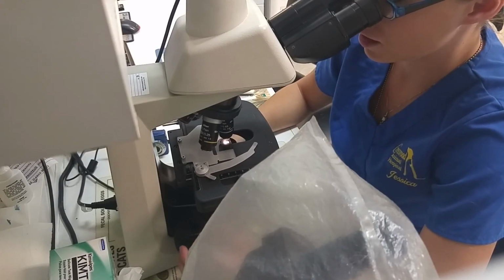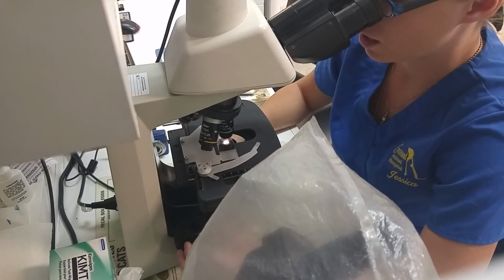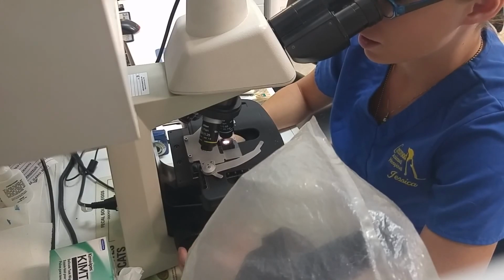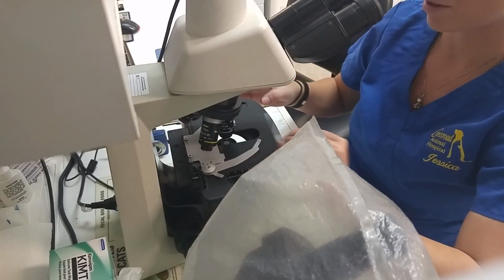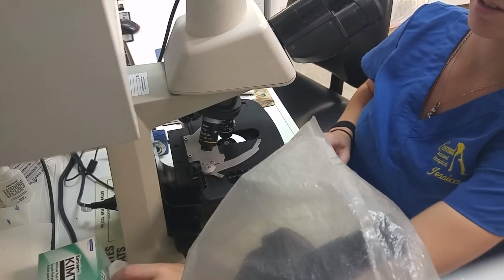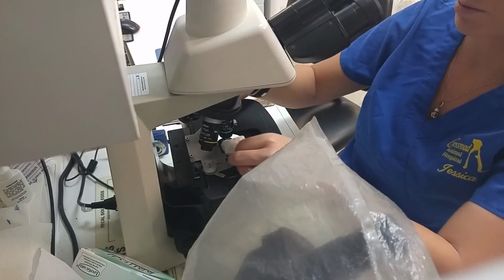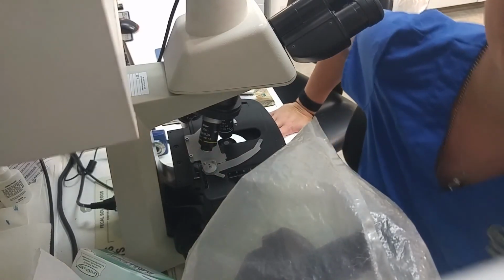But other than that, the skin scraping appears perfectly normal. And the dog is not symptomatic, not really itchy or anything. So we'll go ahead and just continue. There's no treatment needed, so that's about it. Take this off. Just in case the oil got on the microscope, we'll go ahead and clean this, and I'm going to make sure that I wipe the lens as well with the Kim wipe.